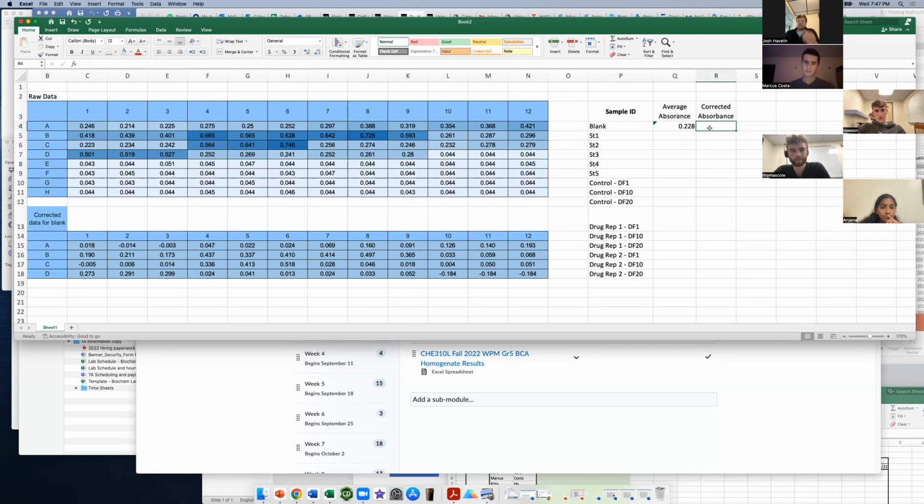So this is why I said last week, if you had spent the time to do this last week, you could just copy and paste this data in. If you had already done this, it would be done. But if you didn't, you get to have the fun of going average this. So that's where we put our corrected blank data. So average that. I'm going to cheat a little bit, which isn't going to fix my problems. This is going to make more problems for me, but it's faster than typing average over and over again. So now, basically Excel connects everything in a linear fashion.